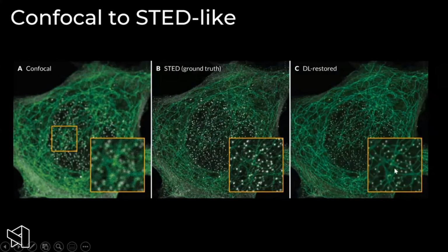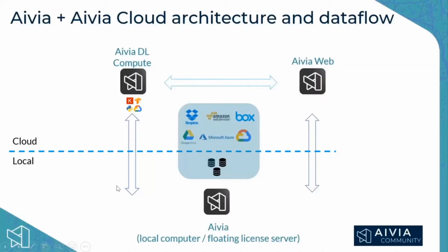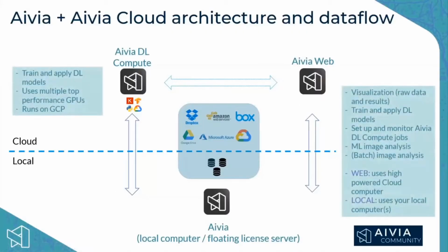And some people actually prefer to look at this data than this data because it's less noisy as well. But definitely higher resolved, higher resolution. Okay, so I want to move on so that we can get to actually using Aivia as quickly as possible. But before we do that, I wanted to illustrate or just explain what we'll be using.